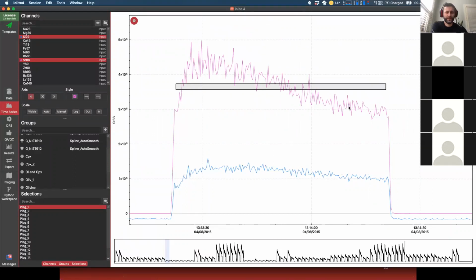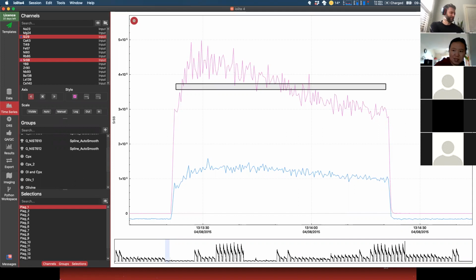Joe, did you have any tips for that? Hey, Joe, how you going? Yeah, good. No, I don't really have any tips. I mean, we can add that. We'll look into adding that. There might be other implications for that as well.